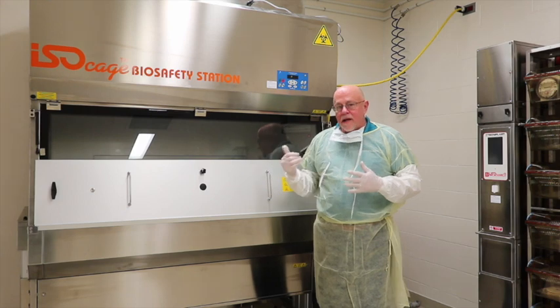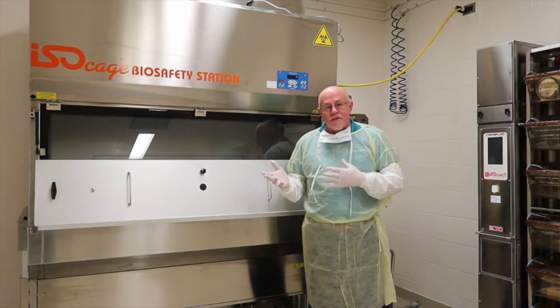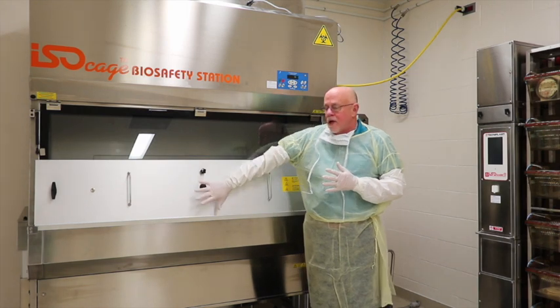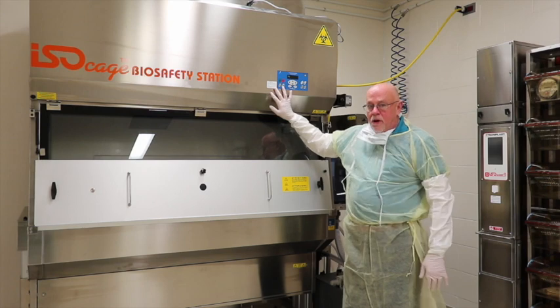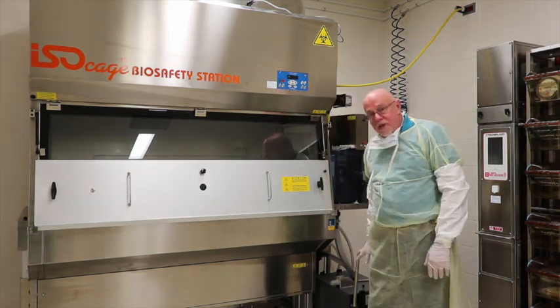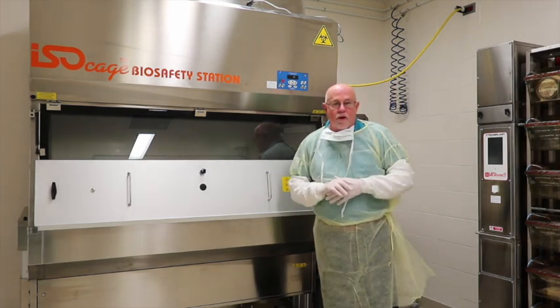We're now back in front of the IBS change station. There are a couple of different things we're going to show here. First, we'll show how to remove the front cover. We'll then show how to turn the unit on as well as how to connect the dump tank in order to get it ready to work.